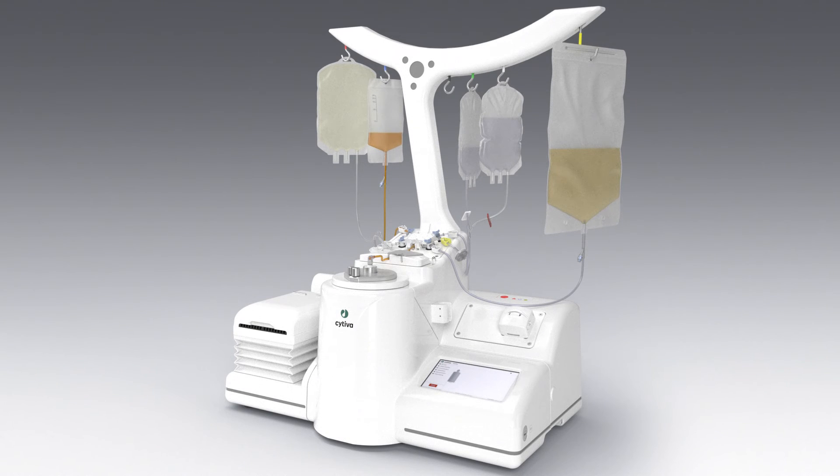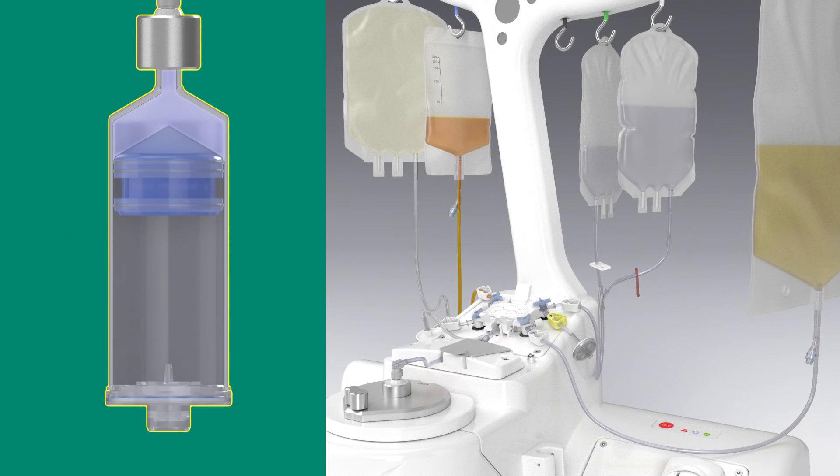Finally, the system formulates cells with the resuspension solution and volume you select.